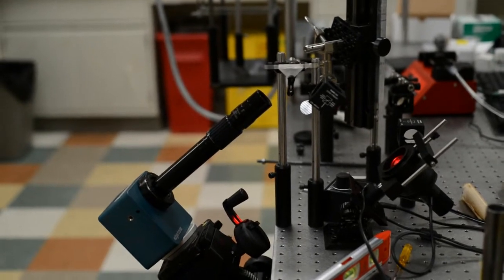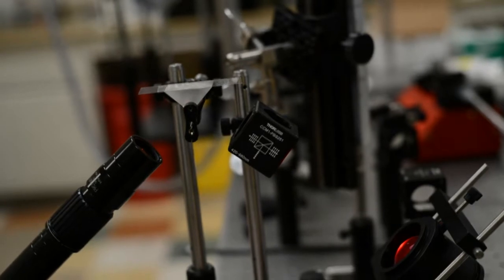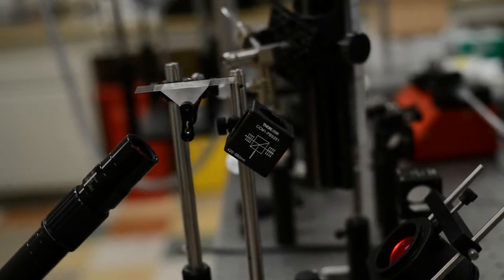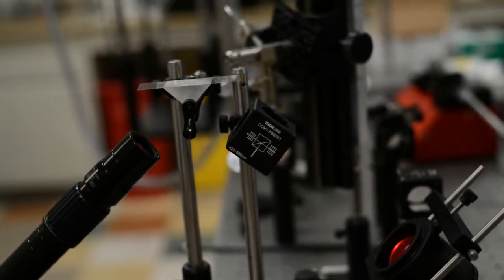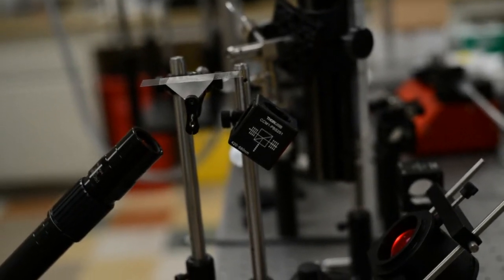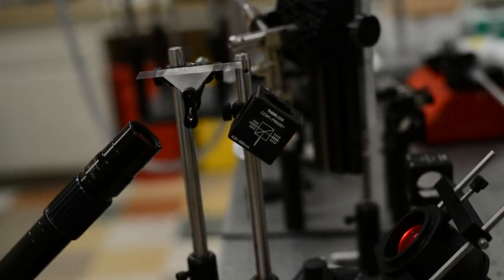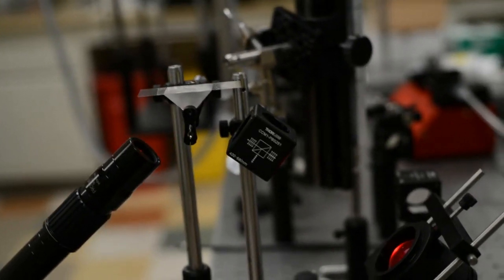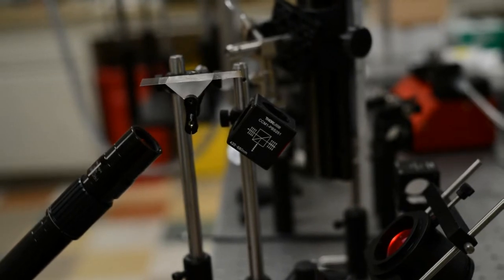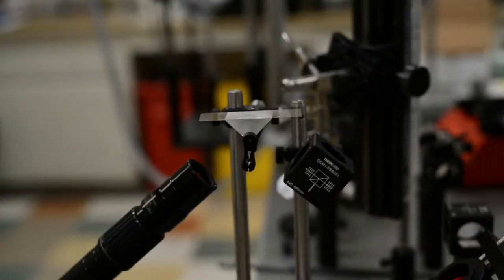And so this is really the basic setup, and you can also see that there's a box in between the light and the prism, which is a polarizer, and this basically gives us a known reflective behavior and transmitted behavior of the light when it's polarized. Therefore, we can use the Fresnel laws in optics to have a good understanding of the reflected and transmitted components of the light on top of this prism.